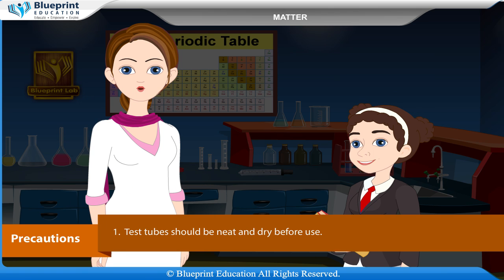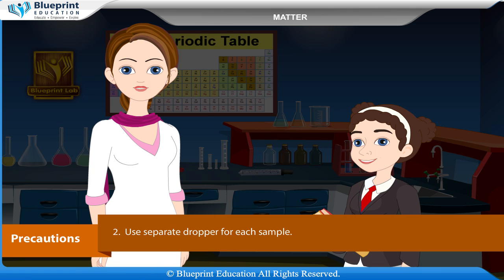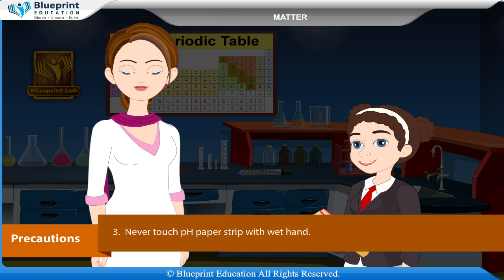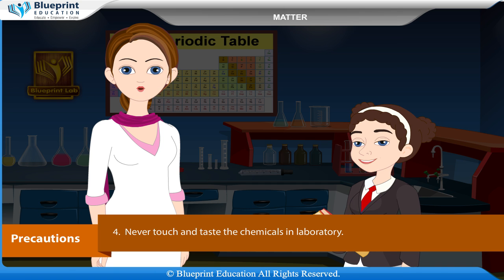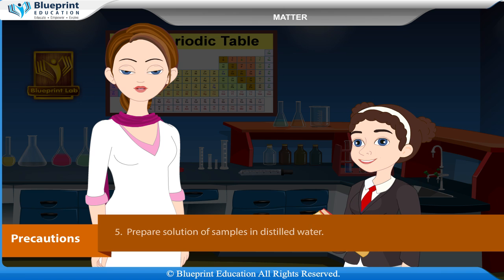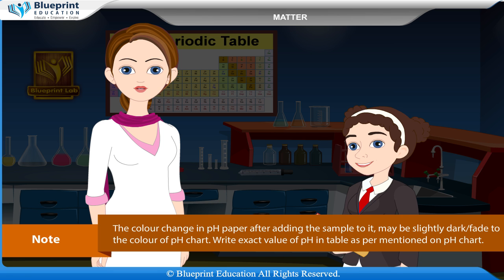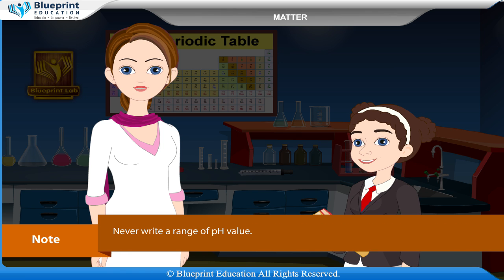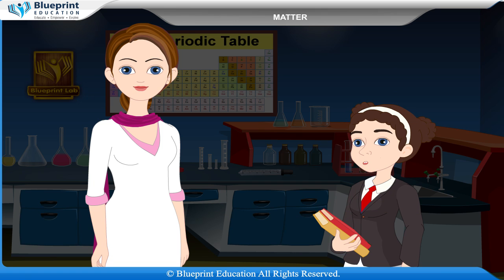Precautions: Test tubes should be neat and dry before use. Use a separate dropper for each sample. Never touch the pH paper strip with a wet hand. Never touch or taste the chemicals in the laboratory. Prepare solution of samples in distilled water. Note the color change in pH paper after adding the sample — it may be slightly darker or lighter than the pH chart color. Write the exact value of pH in the table as per the pH chart; never write a range of pH value.